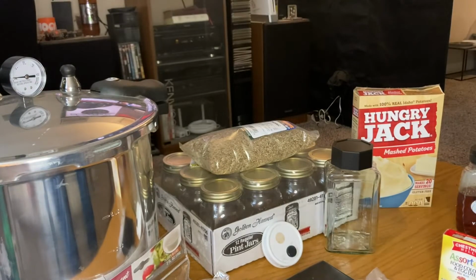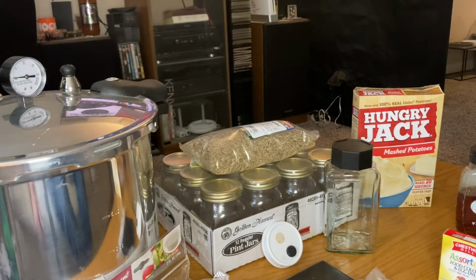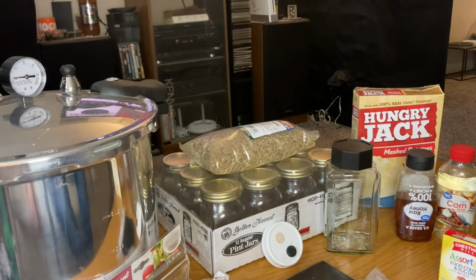Then from there, instead of using any kind of yeast, we're just going to go with the Hungry Jack mashed potatoes that you can see right there. And with that, you will just do a 3-2-1 recipe. So you would do 3 grams of the potato flakes, 2 grams of the agar powder, and then you'll want some corn syrup or honey, which are both right here. And I usually like to do a little mix of both.